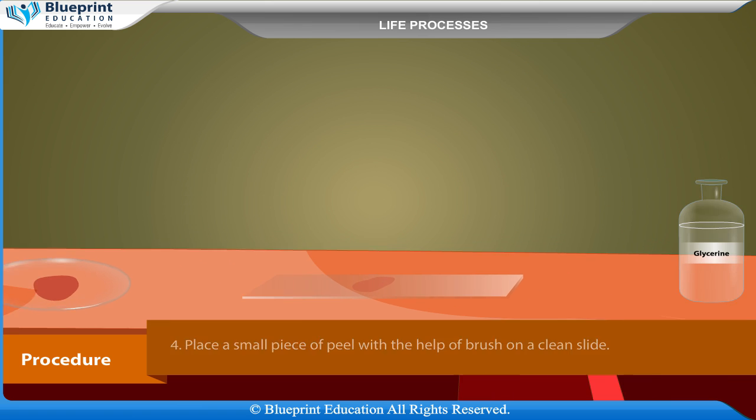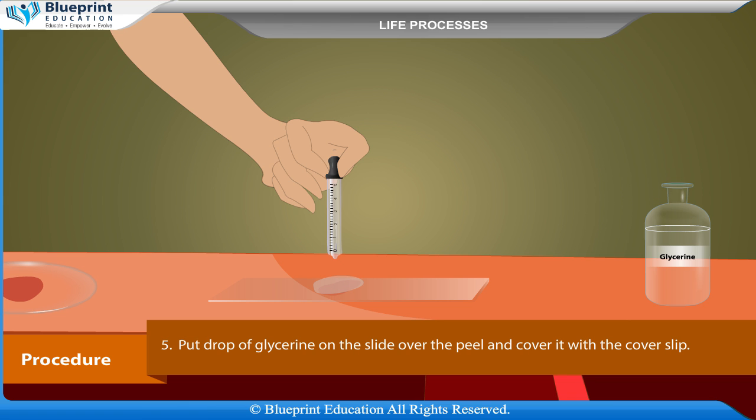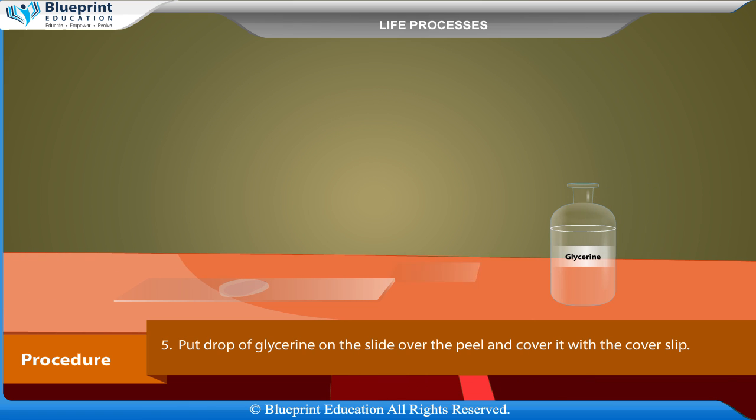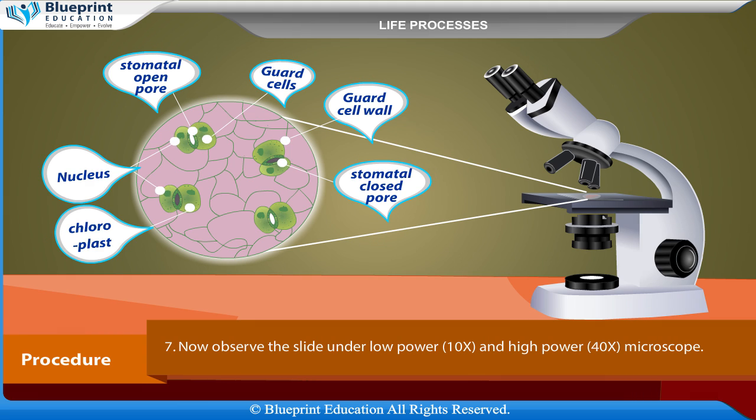Put a drop of glycerine on the slide over the peel and cover it with the cover slip. Remove extra glycerine with the help of blotting paper. Now observe the slide under low power (10x) and high power (40x) microscope.